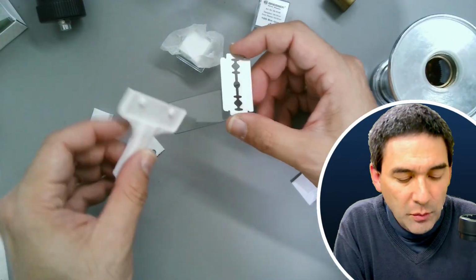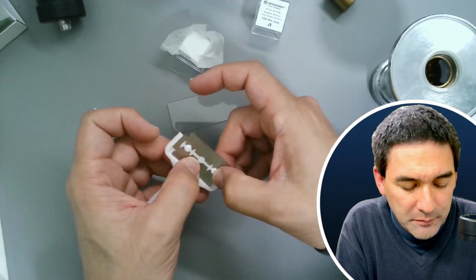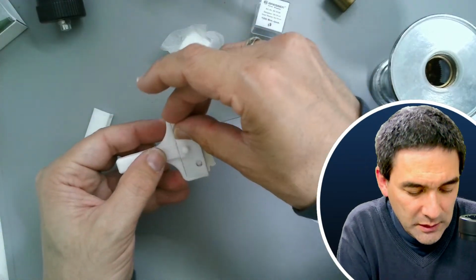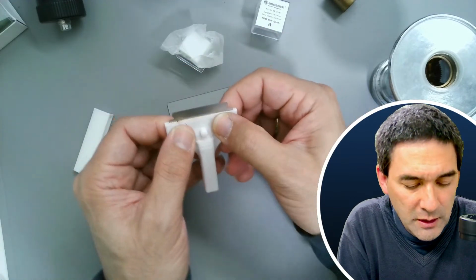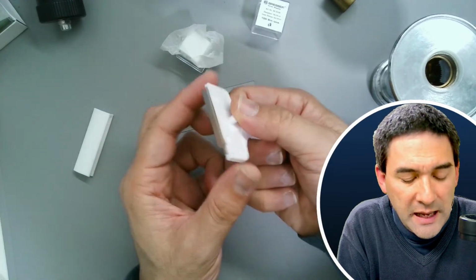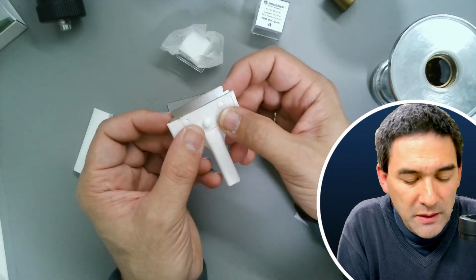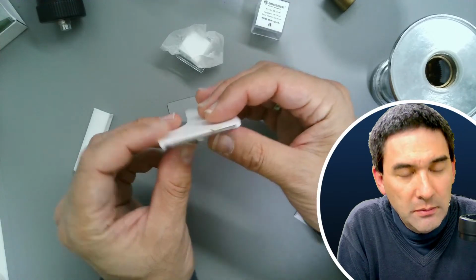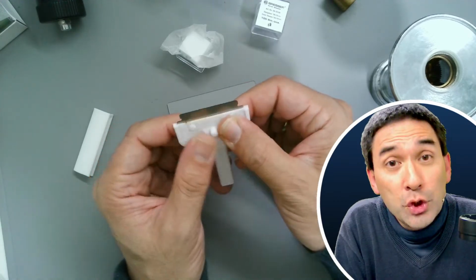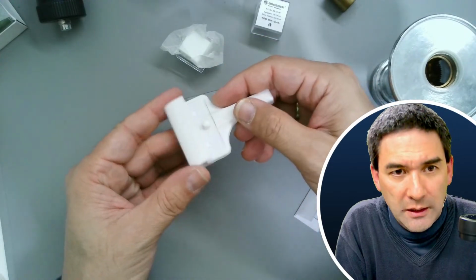So I found somewhere online a plan to make this here, and I 3D printed it, and it goes like this. And then how does this go? I think it's like this here. All you have to do is press it together, and this not only protects it and gives it a little handle, but also prevents it from bending. I've tried this a few times already. It is still a little bit flexible here in front, but actually it works quite well. I've also tried to use cutting board knives, and cutting board knives are not sharp enough. Okay, so actually this seems to work quite well. And then you have a protective little cover over here.